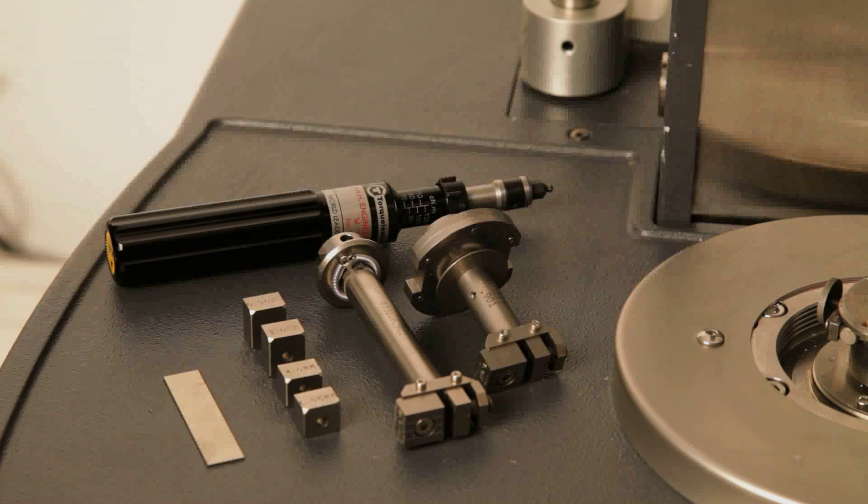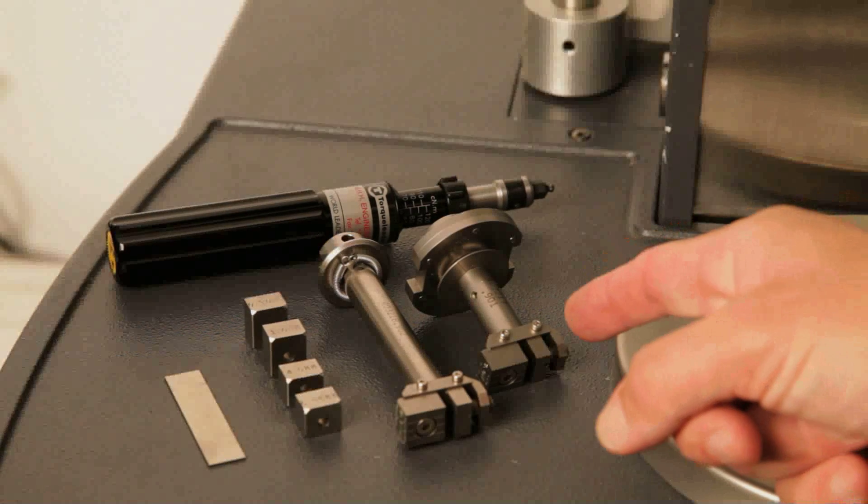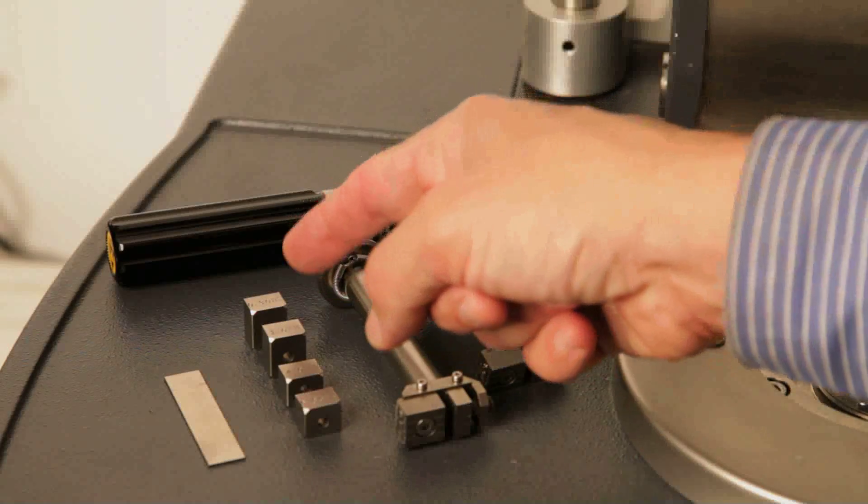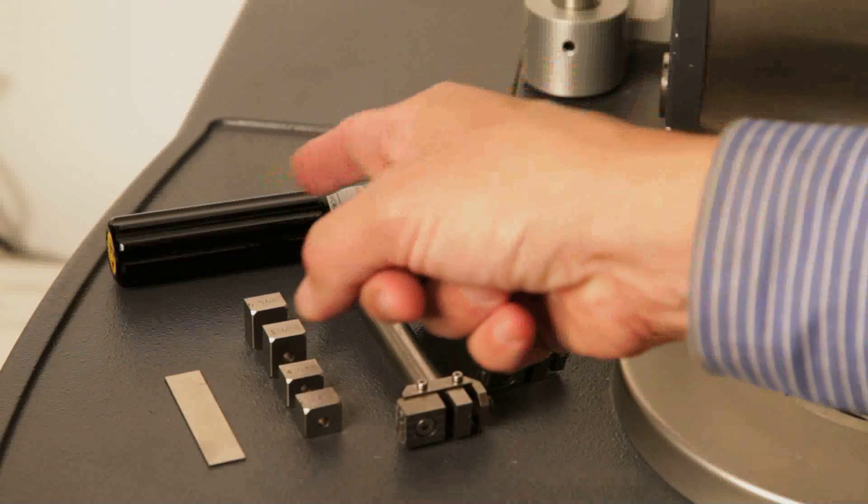The torsion kit includes the lower clamp fixture, an upper clamp fixture, inserts for various sample thicknesses, and a torsion wrench.